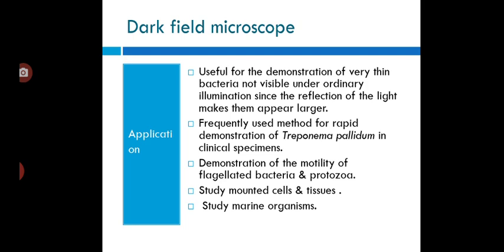Next, it is a frequently used method for rapid demonstration of bacteria such as Treponema pallidum in clinical samples. Next is demonstration of the motility, locomotion or movement of flagellated bacteria or protozoa.